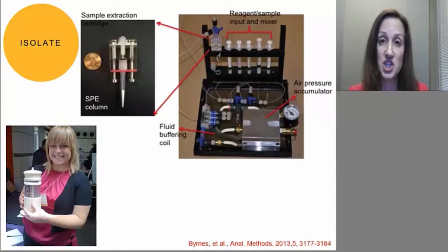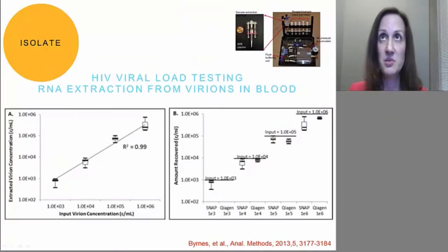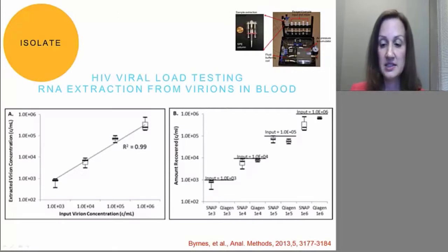The next thing we wanted to do is show how we could apply this technology, and this is some very exciting data. So the technology here, you'll remember, is a portable nucleic acid extraction device. What's interesting about this data is this is HIV viral load testing using this portable device on human whole blood without plugging anything into the wall. So we take the human whole blood sample and we mix it in this device with lysis buffer. We extract it on this little tiny pipette tip that's attachable and detachable from the device. And we then extract that nucleic acid once it's clean from this pipette tip and measure it.